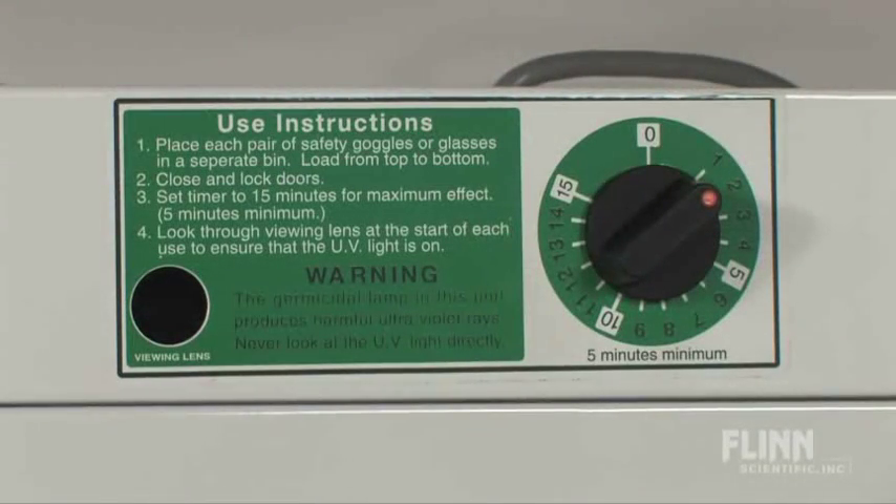A 15-minute timer, instructions, and a light viewing screen are located on the front of the unit, so you will know that it's getting the job done.